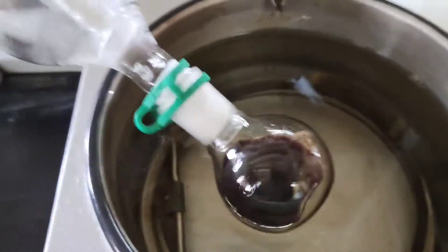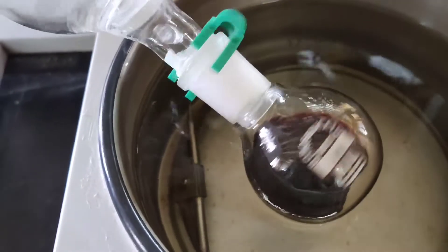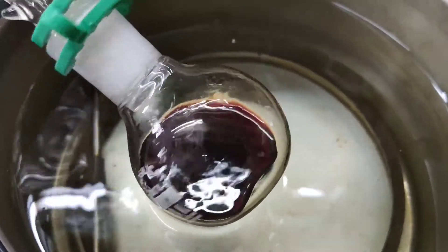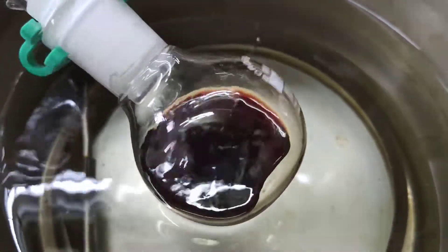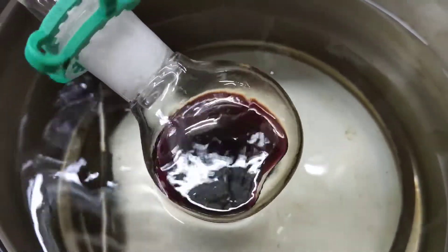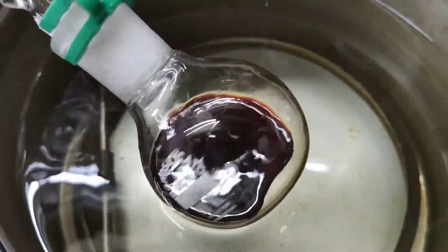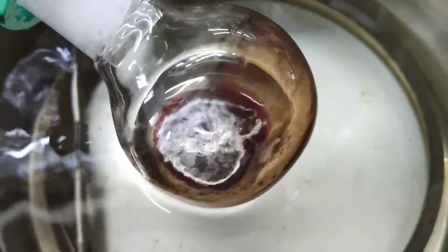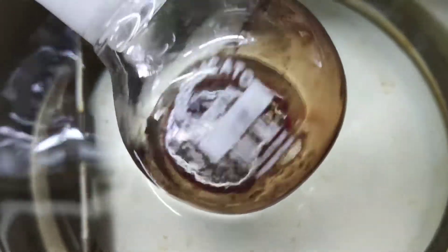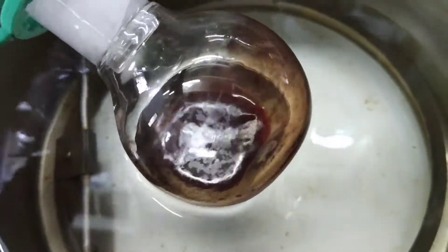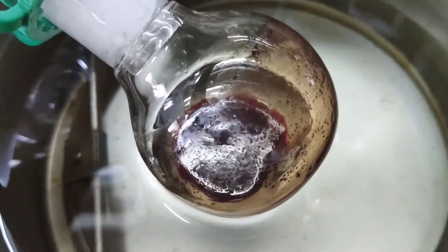We put the round bottom flask in the rotary evaporator and we evaporate it under reduced pressure around 600 millibar for around 15 minutes until the solution gets concentrated enough so that the crystalline material starts to crash out of the solution.